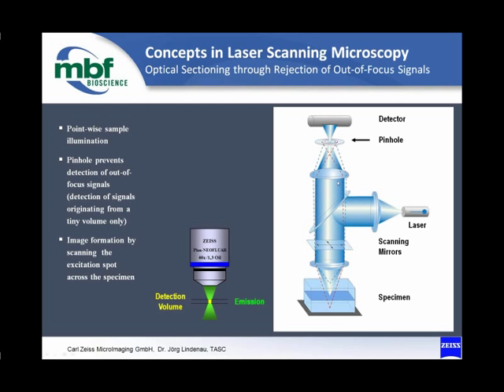The natural progression is to use Stereo Investigator to perform stereology using confocal microscopy. Confocal microscopy differs fundamentally from wide field and structured illumination in that it physically eliminates the light coming from below and above your focal point from ever entering the photodetector. This critical piece of hardware is known as the pinhole, and the diameter that you set your pinhole has a relationship to the optical section thickness.